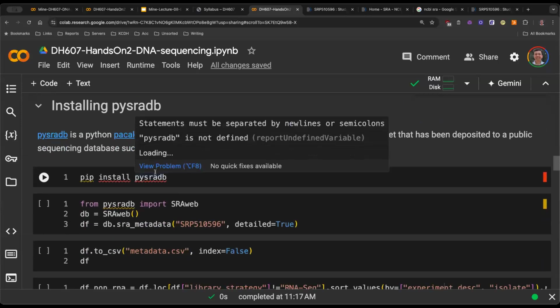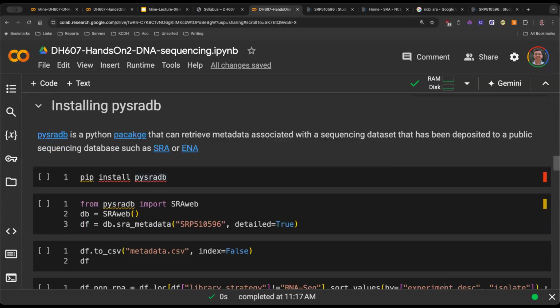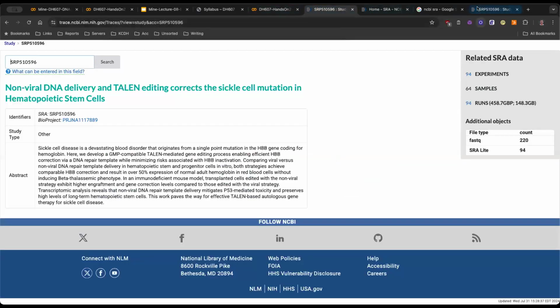Thing that happens in a lot of these projects is you get these gazillions of samples. So you're talking about the sample here. Right. So these are biological samples, which means 64, let's say, slices of tissue or 64 cuts that were done. It could have come from 64 different individuals, or it could have come from one individual, but cut 64 different ways. So these are, in some sense, biological replicates.